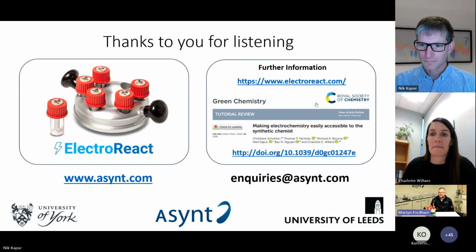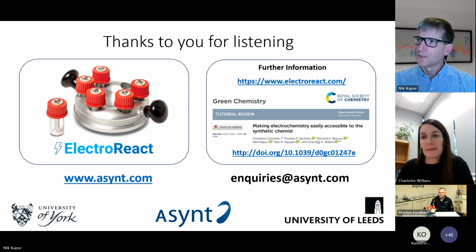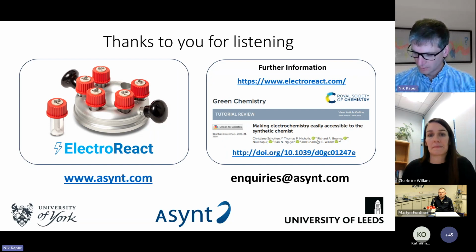Very good. So we've actually got a follow-up on that. Are there currently options for softer foam materials available? They can imagine that the locking mechanism might squish those materials. Yeah, so I'm guessing here you might be thinking of something like a metallic foil or a nickel kind of foam, for instance. So we have used nickel foams within these leads.